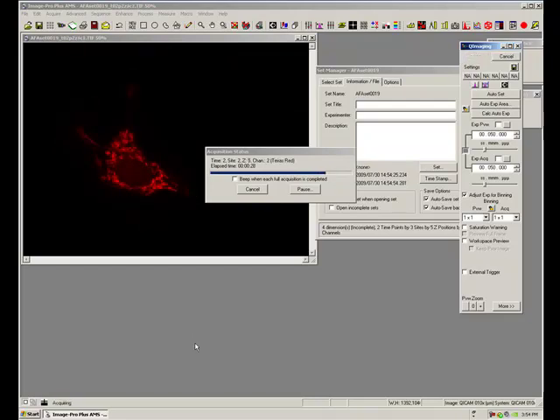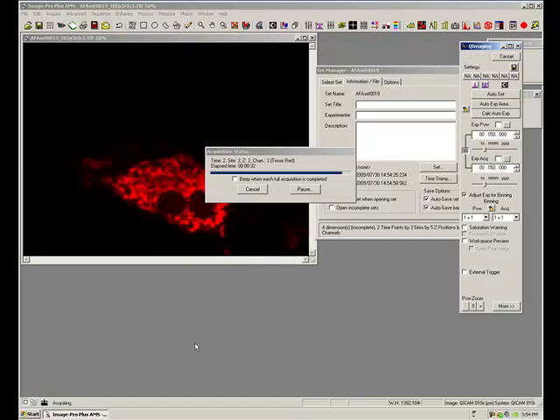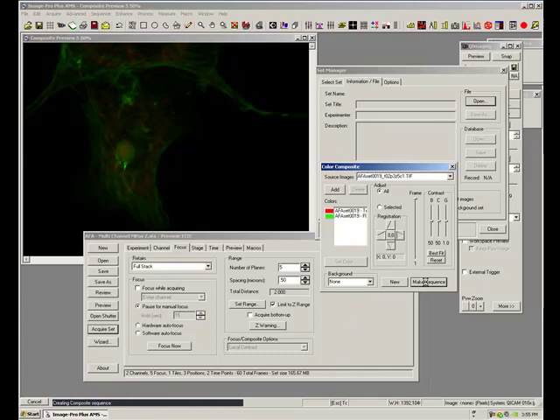But AFA is a pretty straightforward tool. It allows me to do very routine time-lapse analysis, multiple positions, and also straightforward imaging. If I open that up, let's just have a look at that. Let's make that sequence, and we'll just have a look at that.